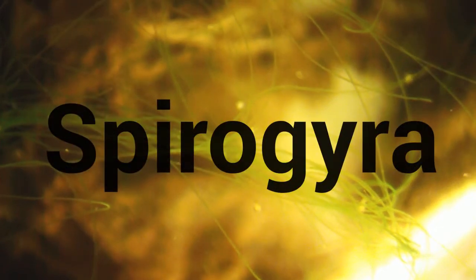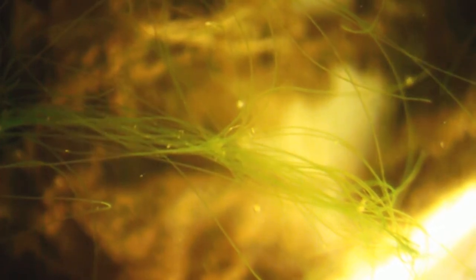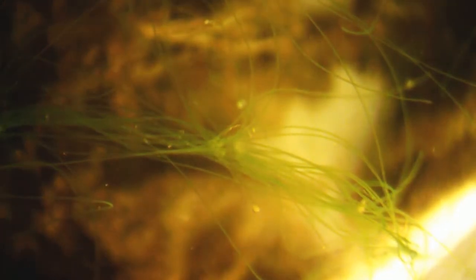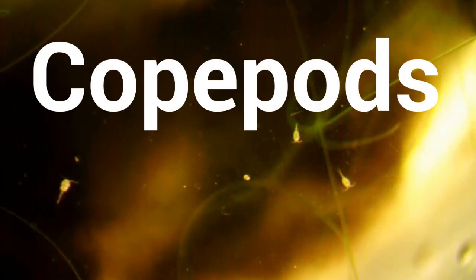Let's start out with the very bottom of the microscopic food chain, algae. This is Spirogyra, a genus of filamentous algae that lives in fresh water. These are autotrophs that photosynthesize to get their food, and are also multicellular eukaryotes, meaning their cells have organelles. Spirogyra and other algae play an important role in the aquatic ecosystem, turning sunlight into energy, but getting eaten by multitudes of grazers. One of these grazers is by far the most common microorganism in the Milwaukee River. Actually, the most common organism, period.